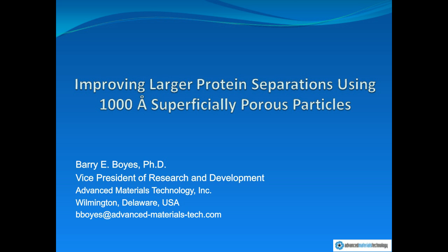Have you tried the 1,000 angstrom column for the separation of protein aggregates? Yes, but how could I put this? Proving that they're aggregates under the conditions that you conduct reverse phase separations is problematic.